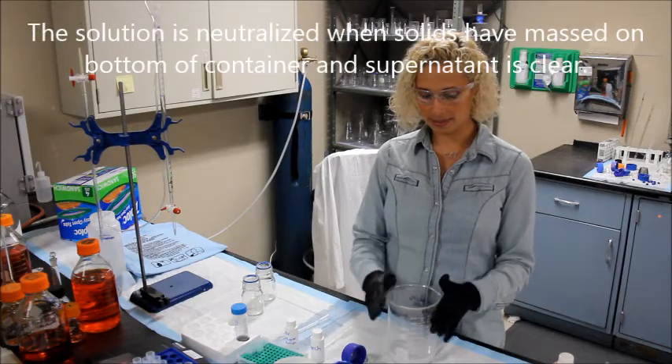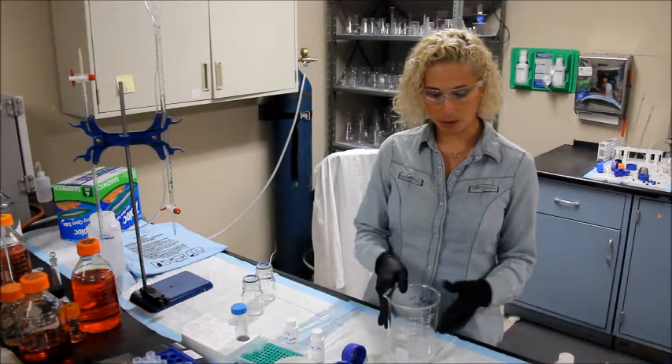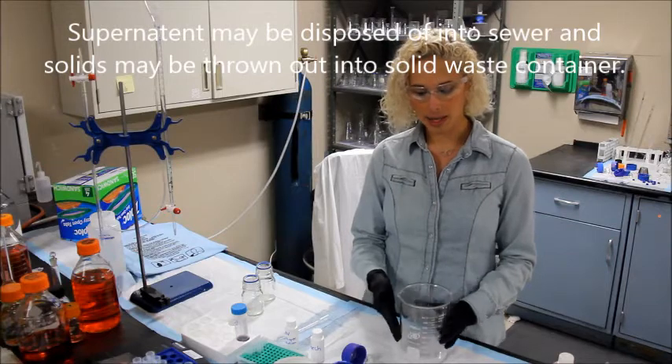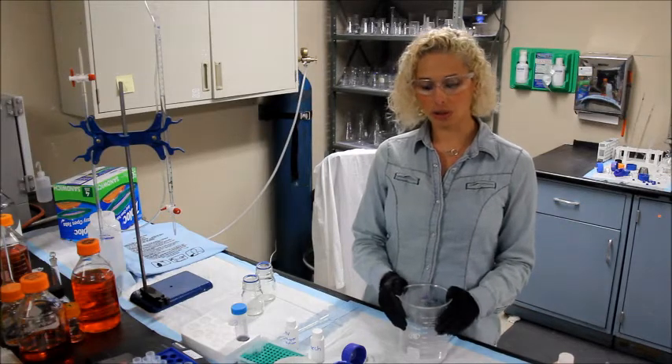If you have more tests to do, it's safe to leave this container with a cover on it. Or you may dispose of the supernatant once complete into a sewer system, and the solids may be thrown away in a normal solid waste system. For further disposal details, please see the manual.